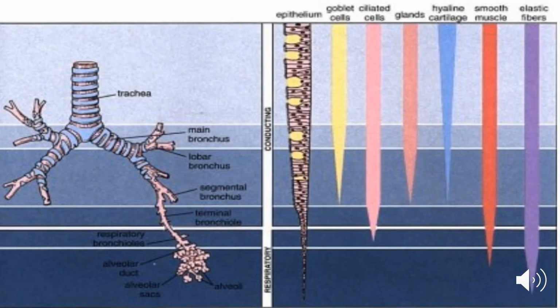Let's have this photo first before we discuss the microscopic characteristics of the remaining structures that belong to the lower respiratory tract system. It's important to be reminded that the diameter of the airway passages will decrease as you move from the trachea down to the bronchi, down to the bronchiole, and down to the level of the alveoli. So expect that the height of the epithelial cells will also decrease, because the height will have an effect on the diameter of the airway passages.